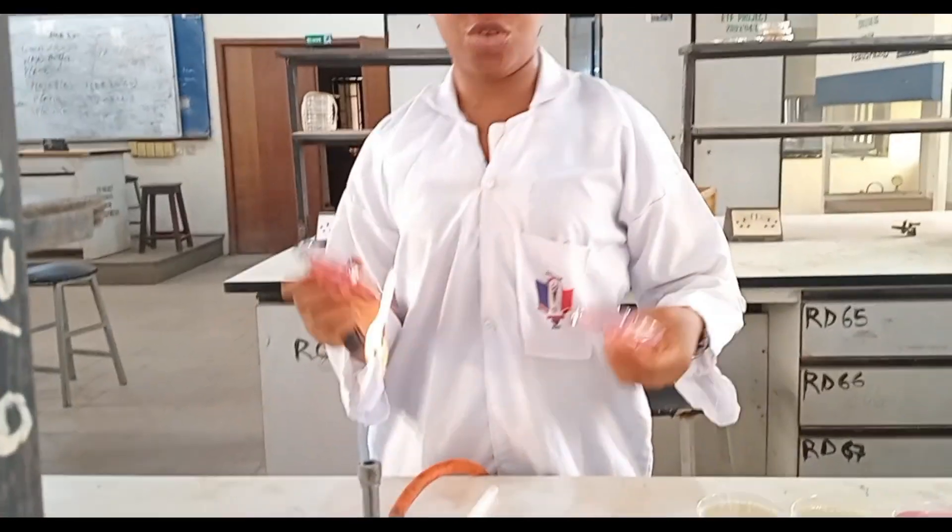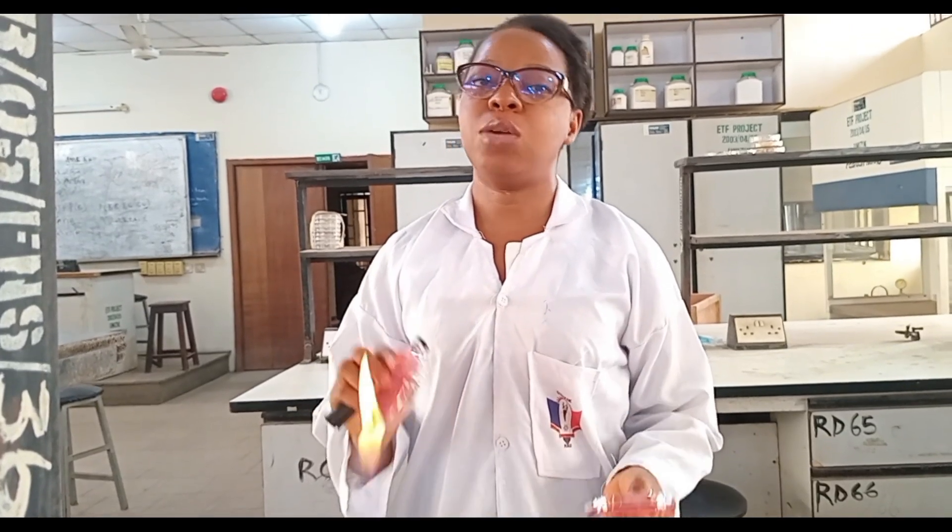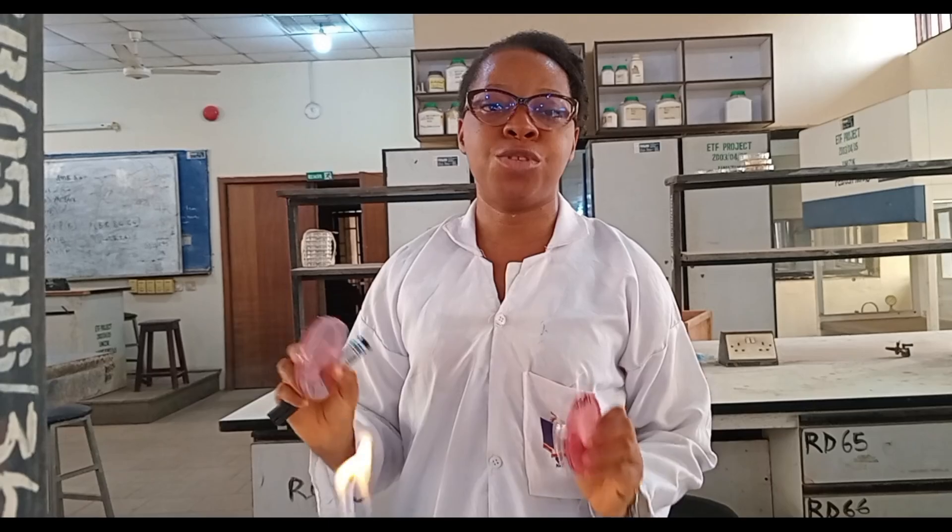I would incubate in the incubator for 24 hours and check my result after 24 hours. I would expect to see Staphylococcus aureus on my MSA, which will show golden yellow colonies.